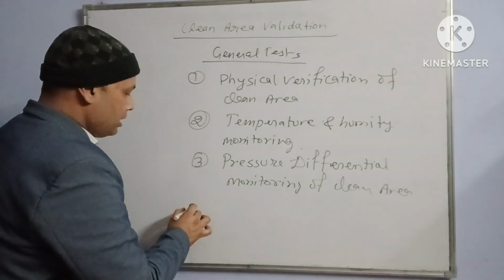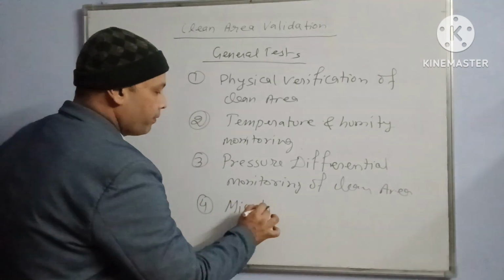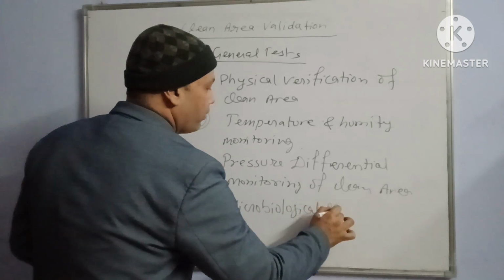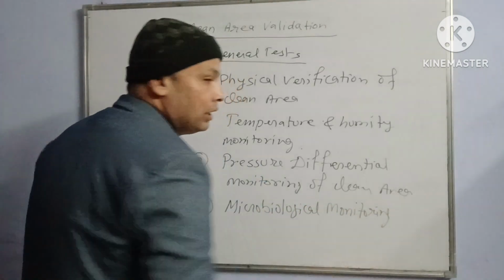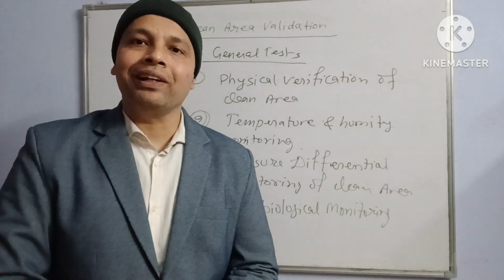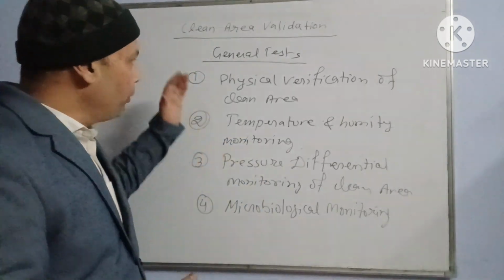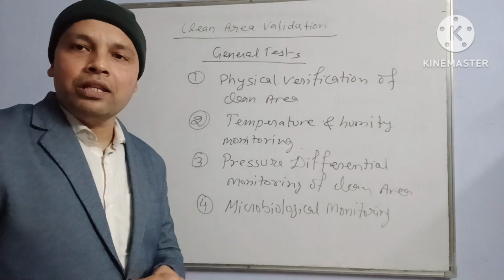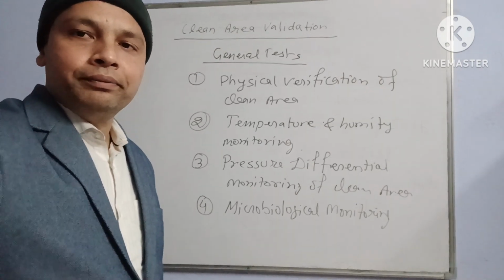And lastly is the microbiological monitoring. We need to perform all these tests during the clean room or clean area validation. Now we will discuss one by one all the tests, the specific tests and general tests, that we should perform during the validation.